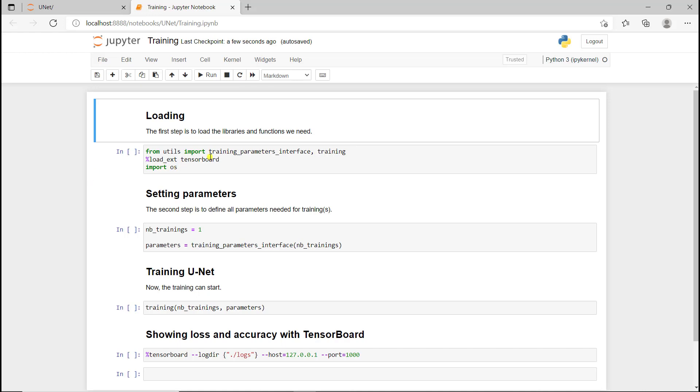We have the first code panel that is used to load all the Python packages and codes we need for what we're doing. In this particular example, for training a U-Net model, we then have a second panel to define the parameters, and a third panel to do the actual job, which is training the U-Net model.